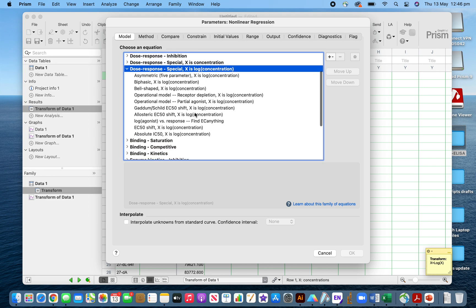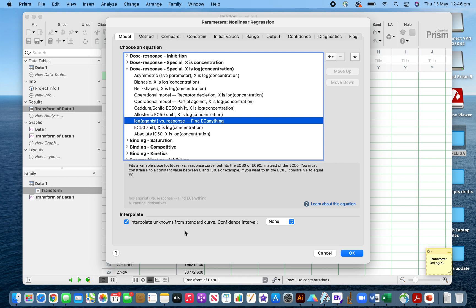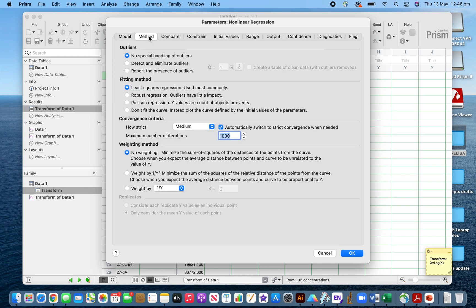I will go to the log agonist response because I transformed the data into log, and then the response, the absorbance, was not transformed. I'll select interpolate also because I need to get the unknown concentrations of unknown samples.